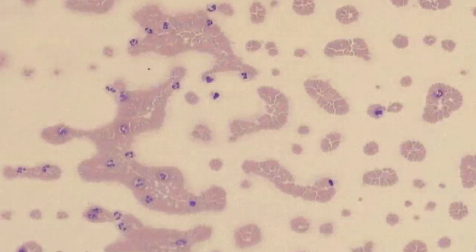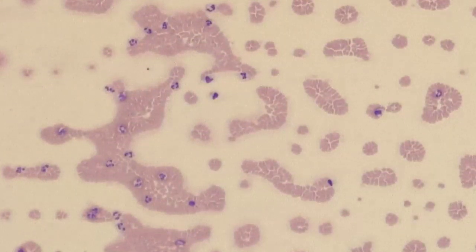Right now I'm just looking at the white cells. This is right in the middle of the slide towards the feathered edge, and if we go out to the feathered edge, we can see the distribution of white blood cells. But if we go out to the very end, we can see that there's a greater amount there. And that's normal, because what happens when you make a slide is that the larger cells get pushed to the end and also along the sides.